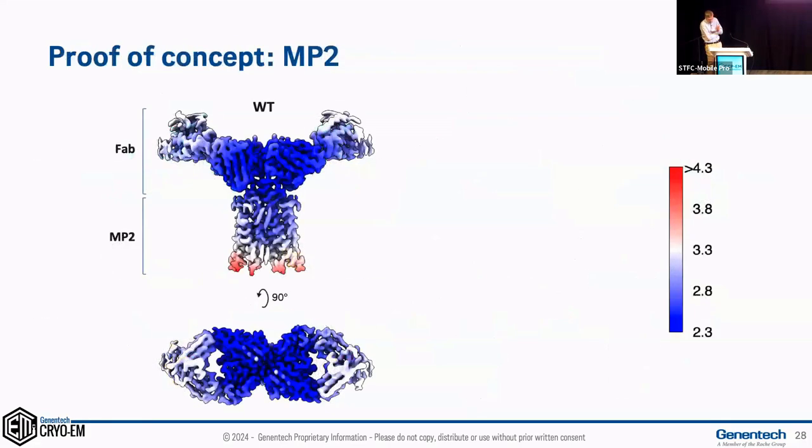And here is another example. I showed you earlier a publication we had with CD20 and Fabs, and the constant domains were completely smeared out. When we used the most rigidified mutants that we've come up with so far on CD20, we went from this situation in wild type.